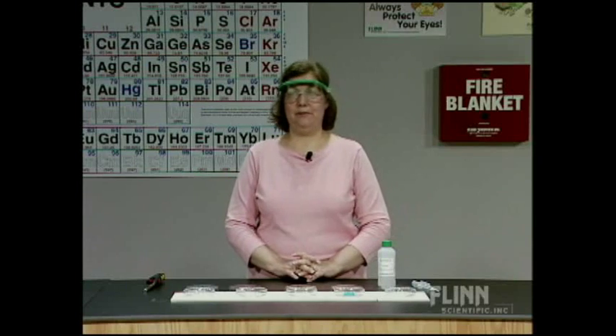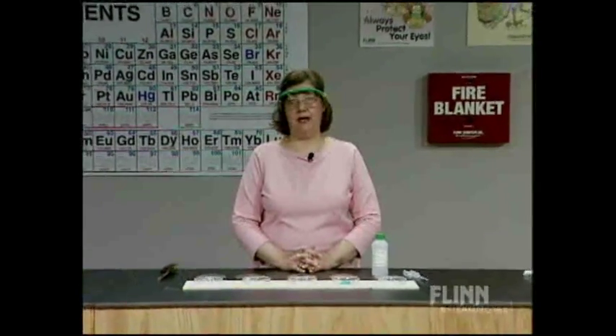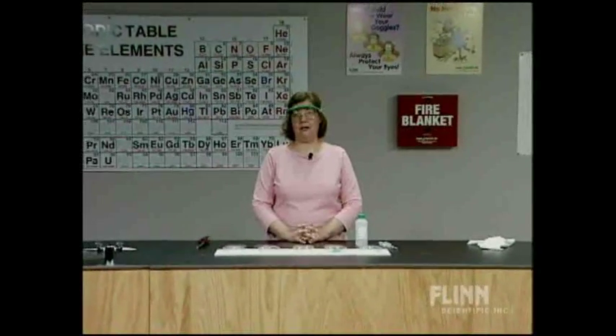Methyl alcohol flame tests - there's been a lot of tragedy with methyl alcohol flame tests and that's a shame. What we want to do today is review in precise detail how to conduct and work safely with methyl alcohol in flame tests, a wonderful demonstration with great historical significance, but only if done properly.